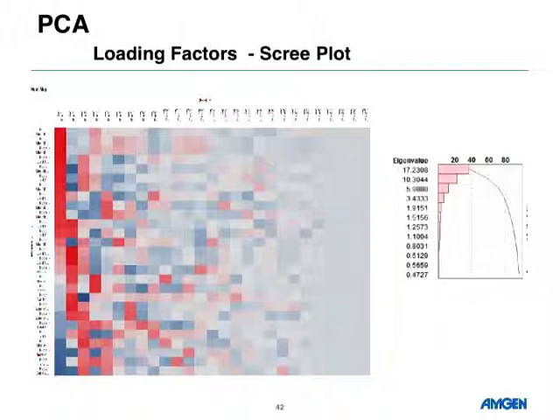If we had 40 different features, we would have 40 different principal components. You can see which features are selected and weighted the most in the first principal component, and as you go further along, you have fewer and fewer differences that your principal components can see. This plot asks how much of the variability within my population space is contained within that first principal component. About 37% of the variability is found in the first principal component. You can usually use about the first three principal components and see a very nice separation of your data.